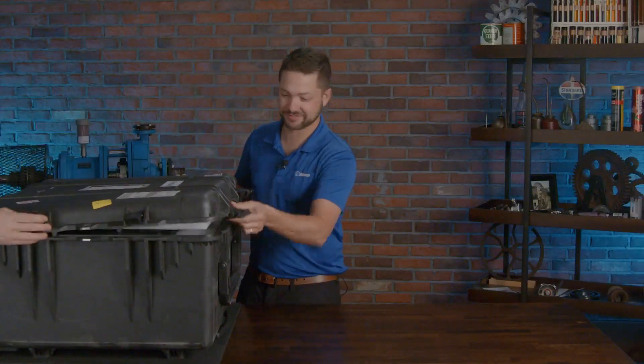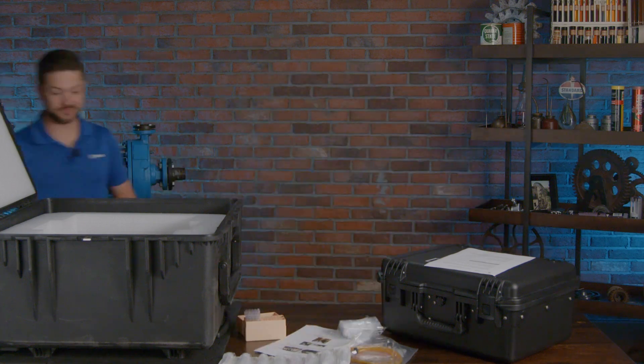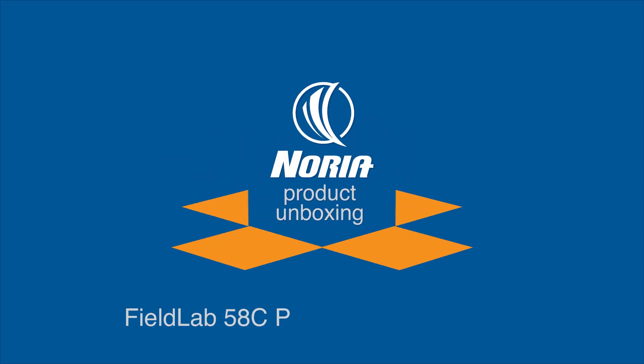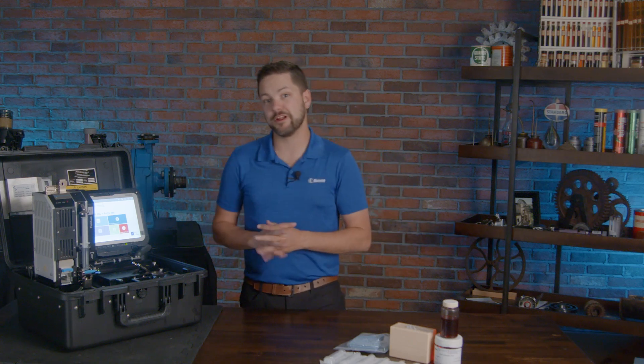Bennett Fitts here and welcome to another Noria unboxing. We're going to be checking out this AMETEK Spectro Scientific FieldLab 58C. This is the flagship solution for their Field Lab options out there. You might remember the Field Lab 33 that we did an unboxing about a year ago.